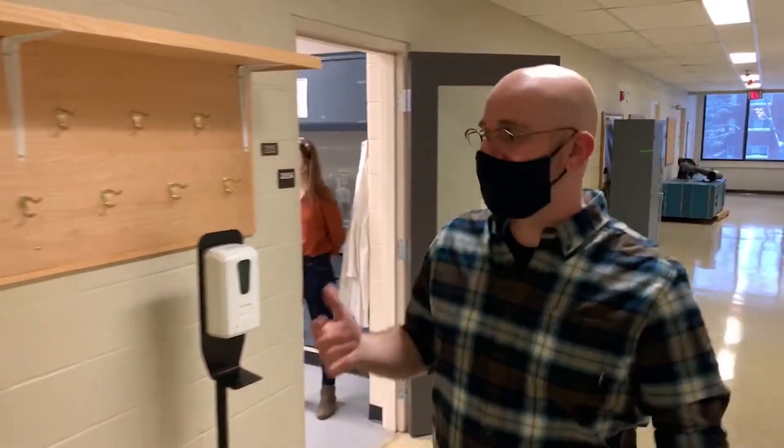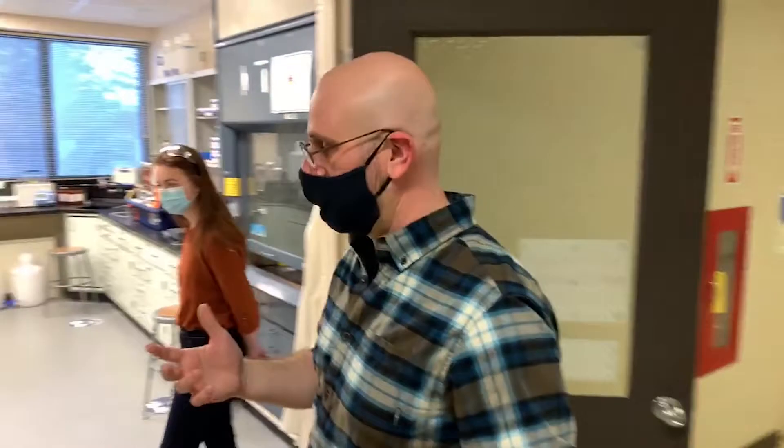My name is Tom Schwartz. I'm an assistant professor in chemical engineering here. We'll walk a little bit further down the hallway to get you a sense of what Gen S Hall is like. In this lab we tend to look at experiments that are a little bit smaller scale than what you saw downstairs.